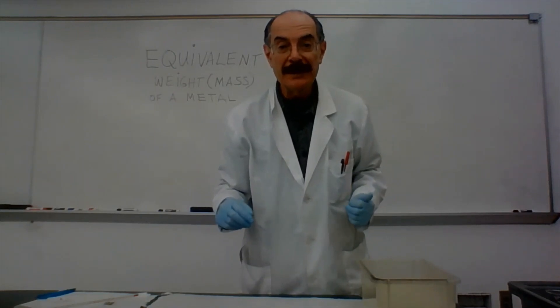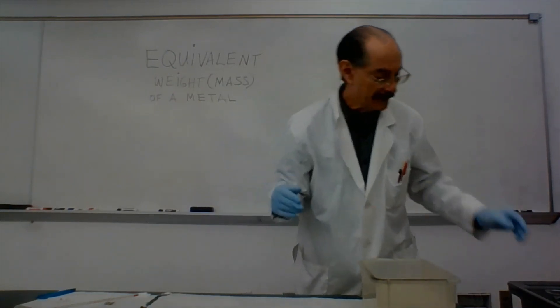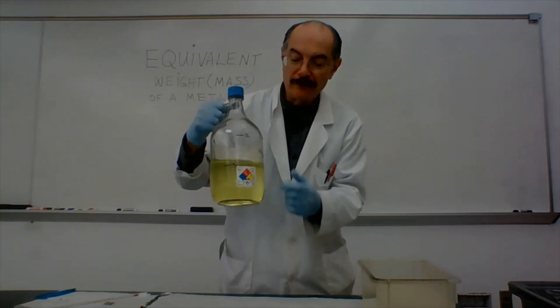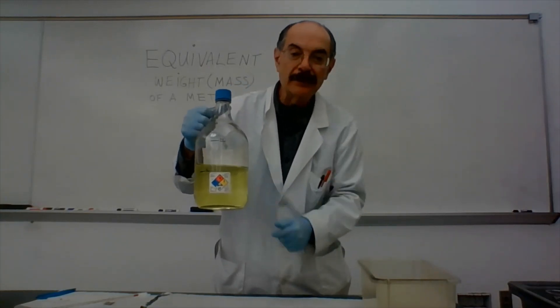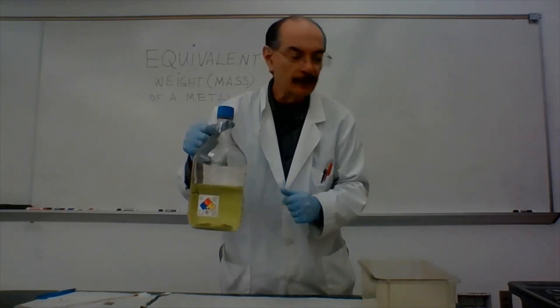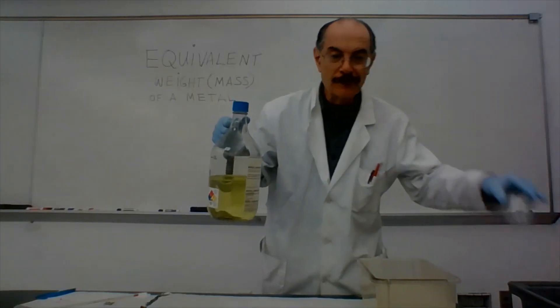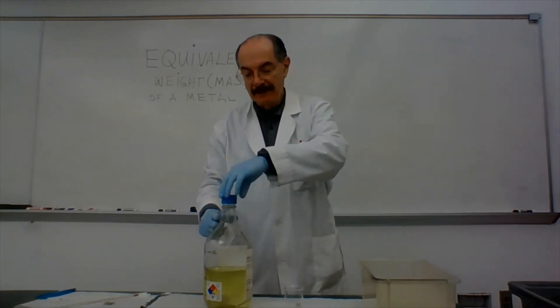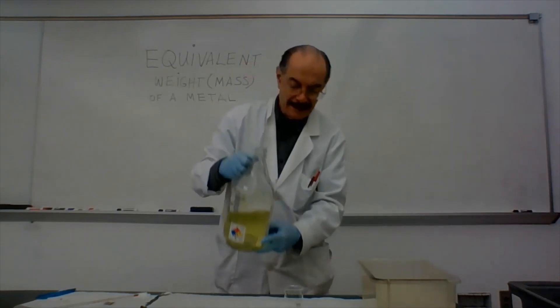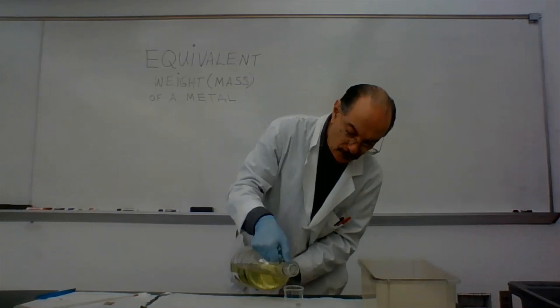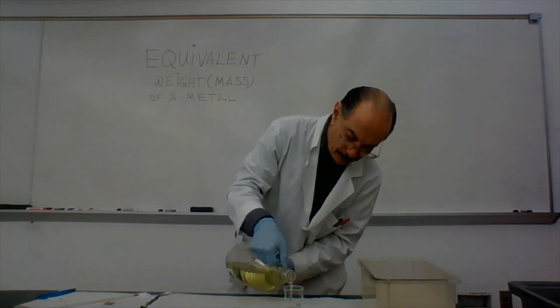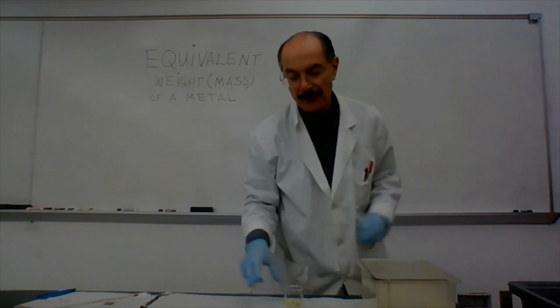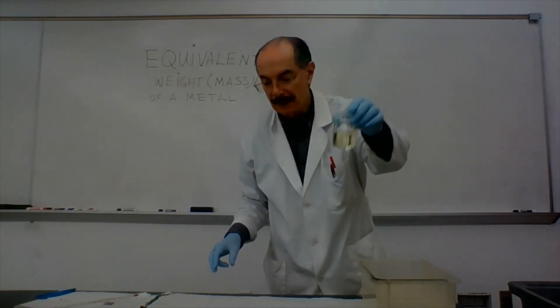You're also going to have to obtain something called green acid. Now let me explain what that means. It's actually just six molar hydrochloric acid into which we've put a little bit of copper chloride to give it a green color. That's so you can track it during the process. Now you're not going to pour from here. As usual, you will bring a small beaker to the cart where this is going to be at. And you don't have to be exact here. You're going to take approximately something like maybe 30 to 40 milliliters. Just remember to pour with conviction or else it'll start dribbling down the sides.